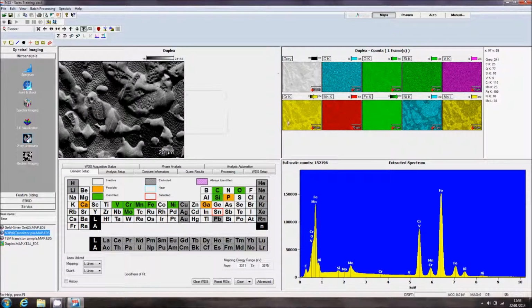So you'll see that these are the elemental maps, which gives you some information, but there are limitations of doing it this way. So the overlay between the moly, nickel and chromium, that is the difference between these two phases, how well these are absorbed. Whereas the iron, which makes most of the material, doesn't actually vary that much across. So if you're just going for this approach, you may miss something, and it'll be hard to actually work out how to quantify the phases.